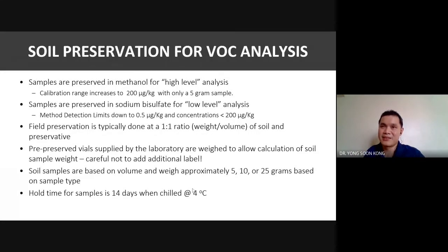But is that significant? If you want to analyze a VOC with a very, very small amount, small changes might significantly affect the result, isn't it? That's one. So you only have 14 days to analyze. After 14 days, what happened to the sample? Throw away. No use at all.